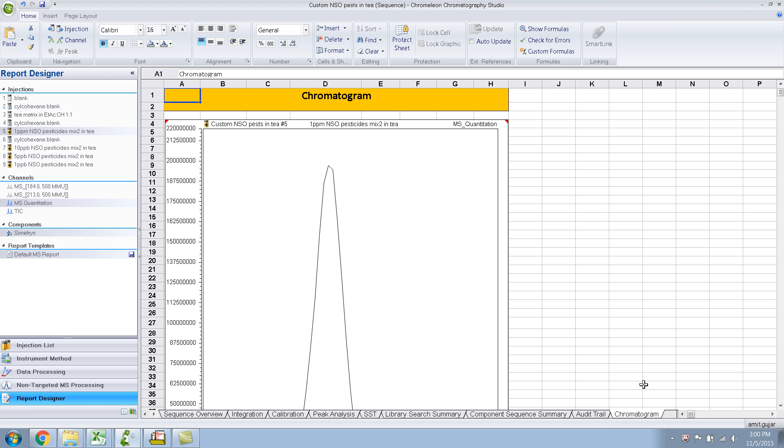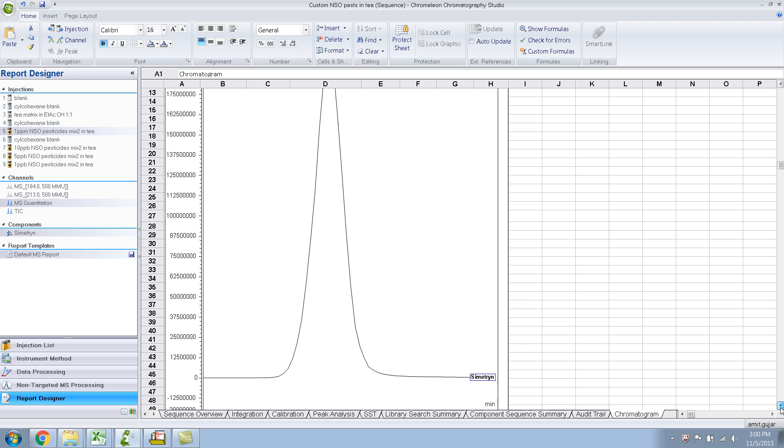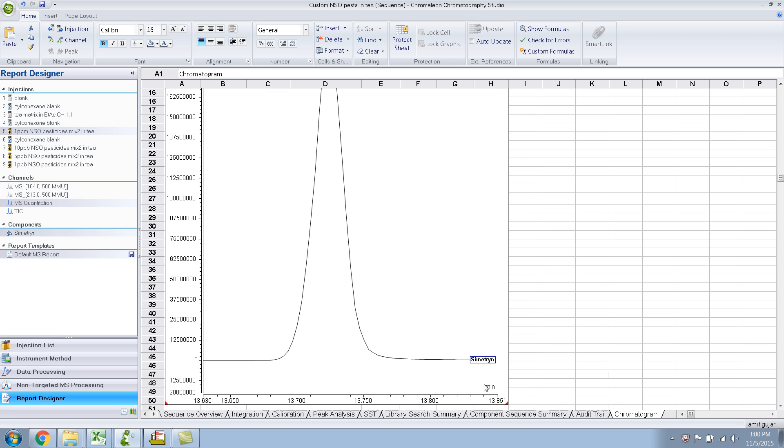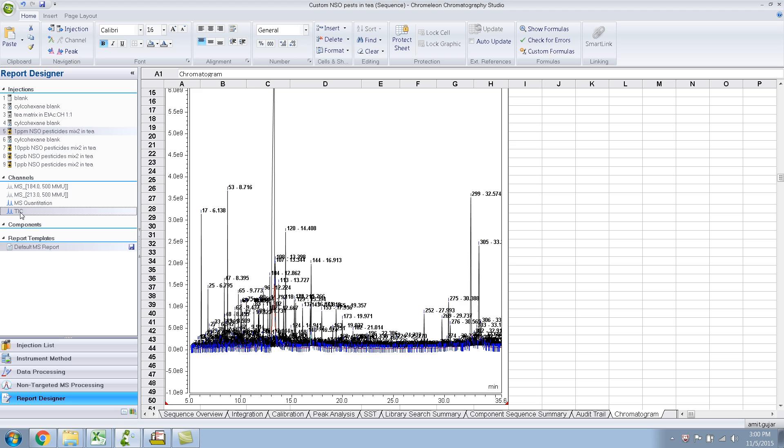And this is the chromatogram itself. So, this is on the MS Quant channel, so if you want the TIC, you select over here, and you'll have the TIC.